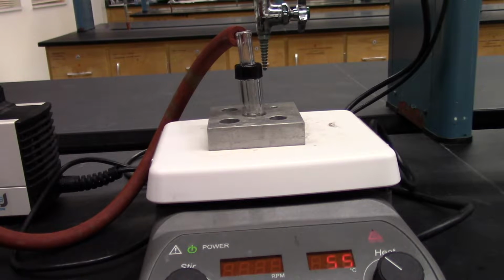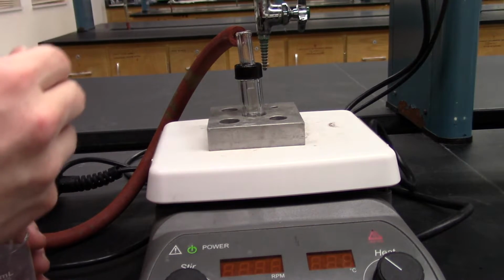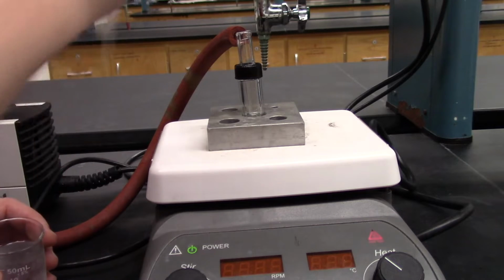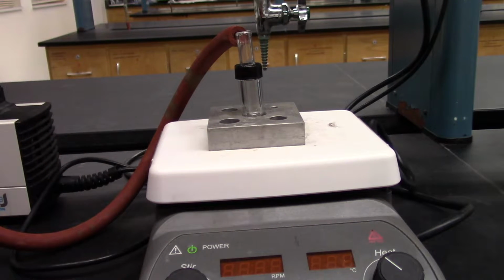You know what? I want to put cold water in there first while you can still hear me. So now I'm going to be adding cold water to the cold finger, and I'm going to be exchanging it every now and then to make sure it stays nice and ice cold. Bigger sublimation apparatuses have water-jacketed condensers just like distillations do, but this is a small one. We don't really need it. All right, here comes the noise.